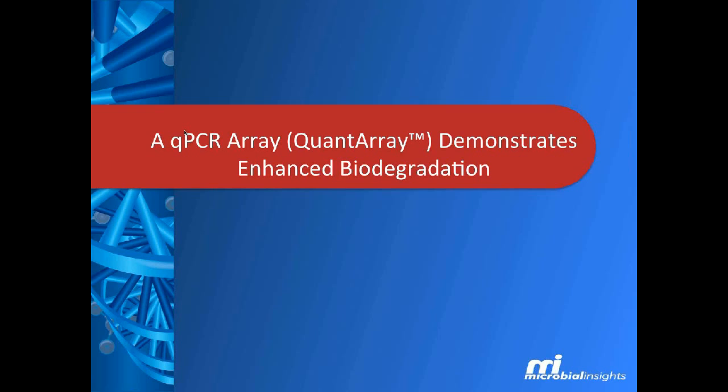For the presentation, I'm going to be talking about a new technology that's available called QuantArray. I want to show a couple of examples of how this can be used. In the beginning, I'm going to go through some background information and even show several biodegradation pathways. I want to assure you that I'm going to get to data from a couple of sites, so if you can bear with me for a little bit, I want to be sure that everyone's on the same page in the beginning, and then we'll get to this new technology and the specific application of that technology.